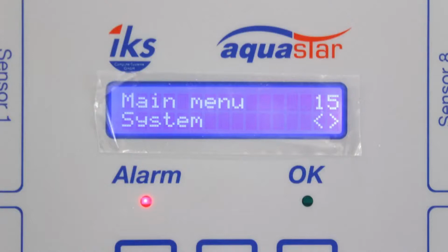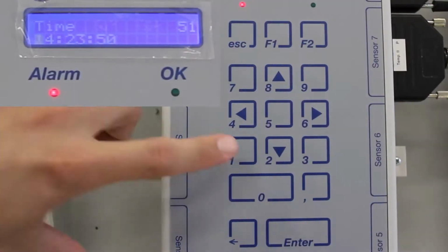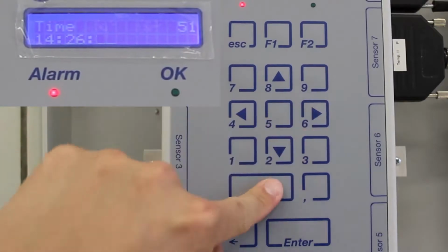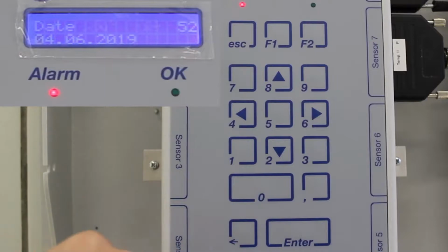Once the equipment has been reset, the display will show the main menu. There are 6 options under the main menu, and you can navigate using the left and right arrow keys. Now, select the submenu System and set the correct time and date. Time is in 24-hour format, while date is in day, month, year format. Then, set the acoustic alarm to On.